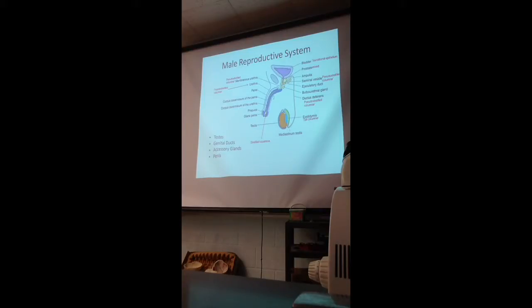Seminal vesicle, again that's an accessory gland. That's also pseudostratified columnar. But the prostate, when you look at the prostate, it's kind of mixed. You can see tall columnar cells, you can also see some more cuboidal cells. So I would say more on the genital tract, it's columnar. On the urinary tract, it's more transitional.